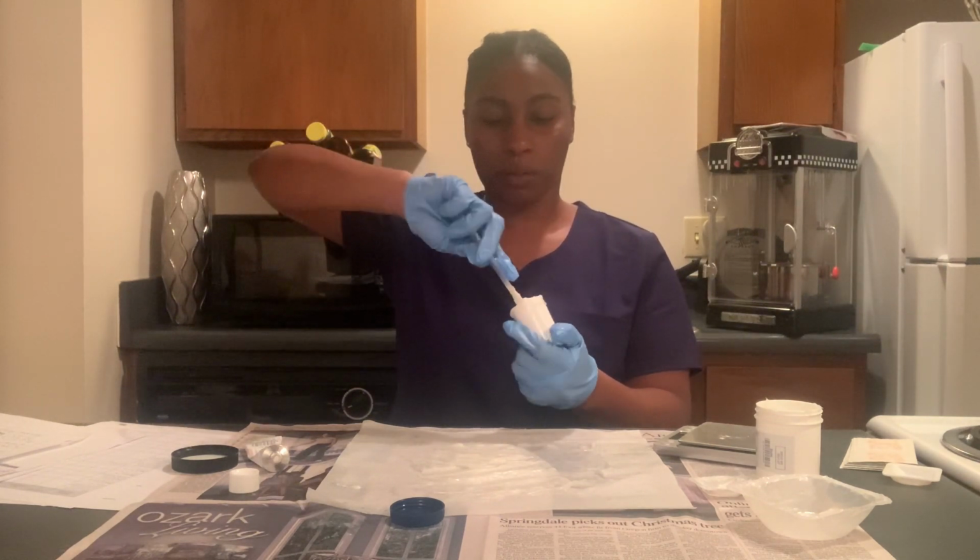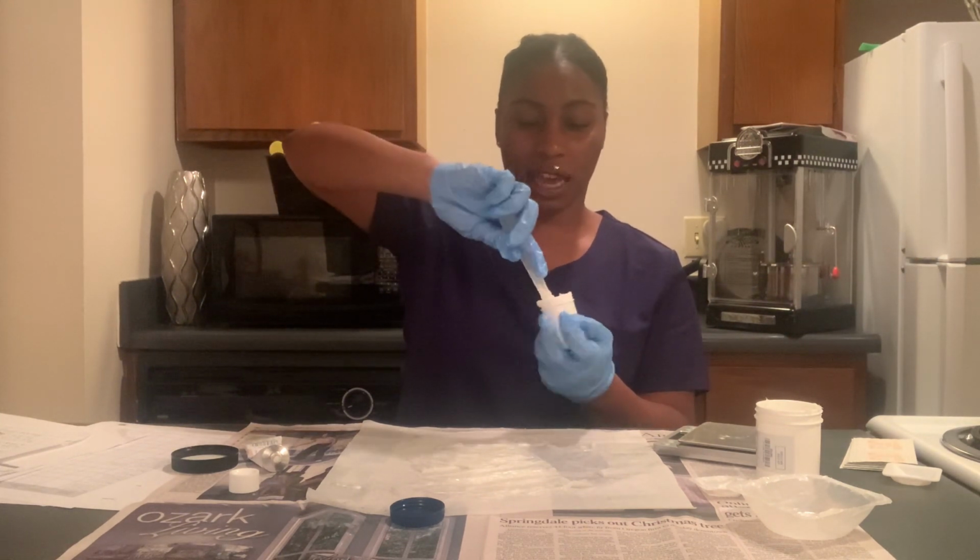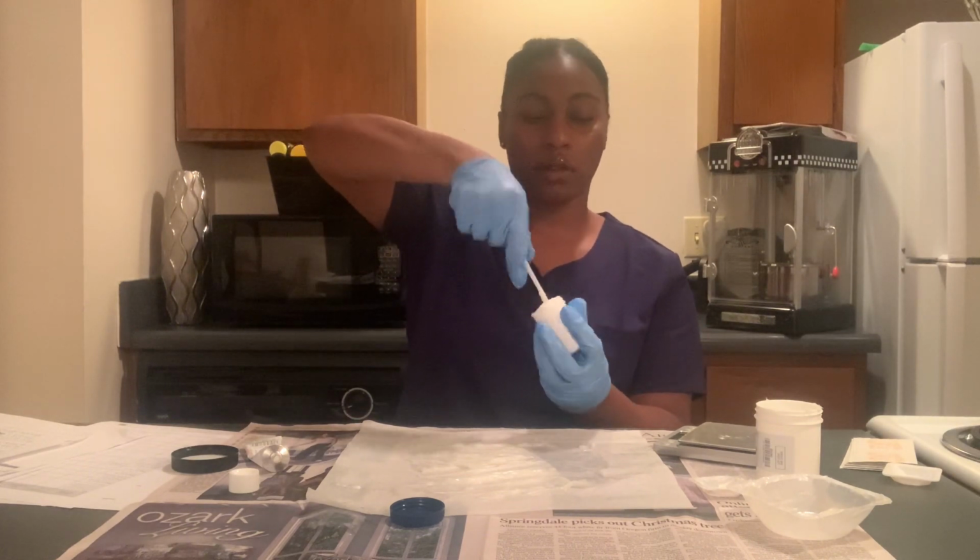So you make sure that when you're putting it in the container, put it in on the sides first, like this.